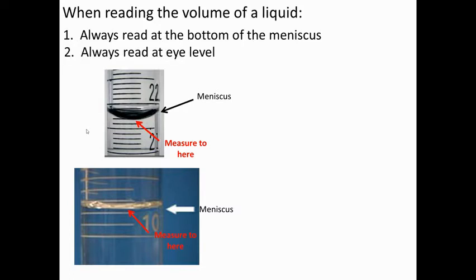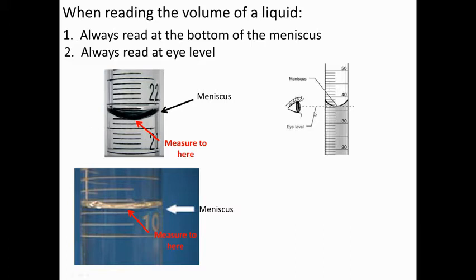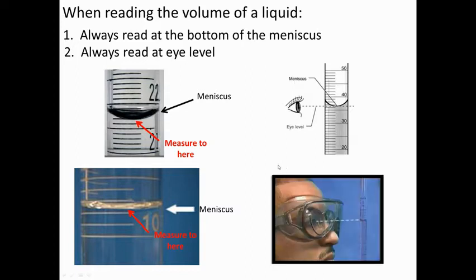Now, when you are reading that, also make sure that you read at eye level, which means that you're looking straight on and looking at the bottom meniscus from the edge. Don't look from above or below. So many times you might have to actually kind of hunker down when you're in the lab to look at it straight on.